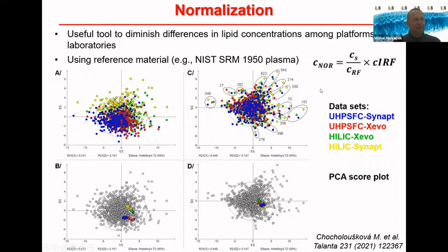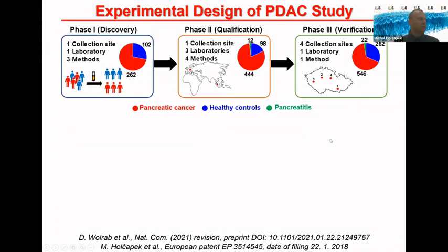It would be really great if you can do it without normalization, but at this moment, simply we are not capable of doing it, and I guess that no one else has tried this so far, but I hope that in the future we may do the same without normalization. But for this purpose, we would need an internal standard for every single molecule, but this is probably out of technical possibilities at the moment. Now I would like to show some data for our cancer research.